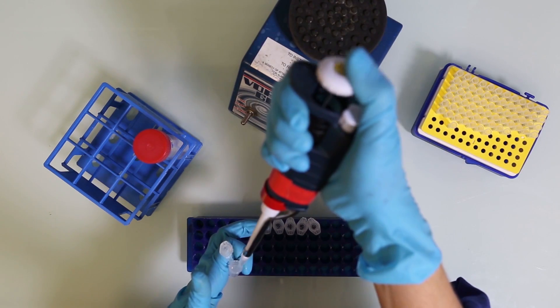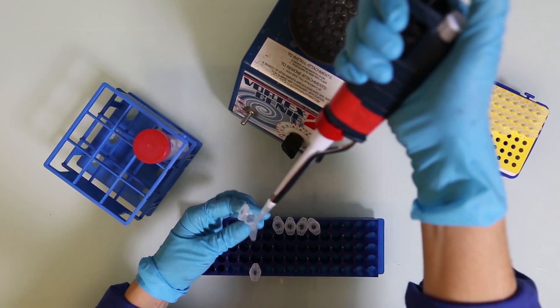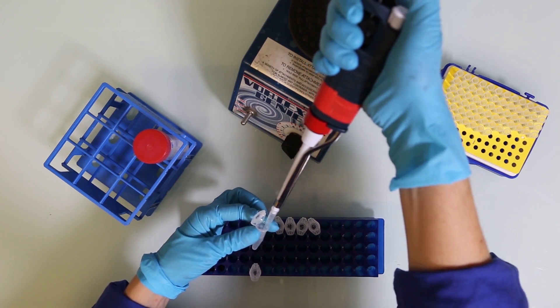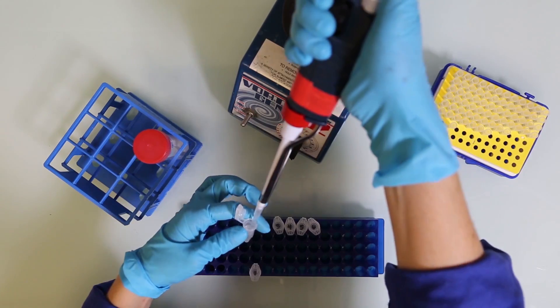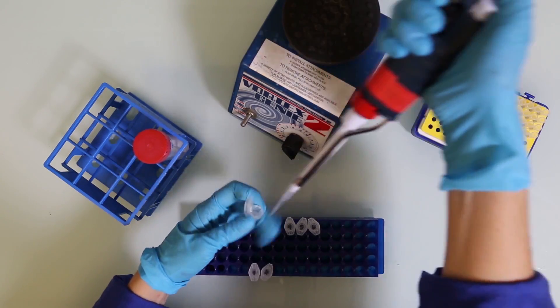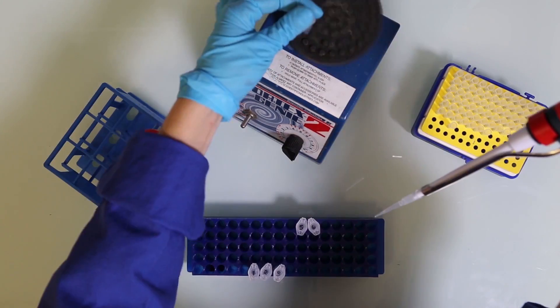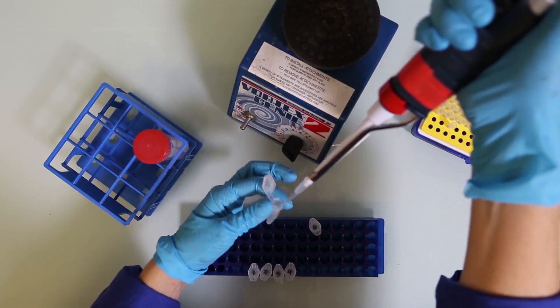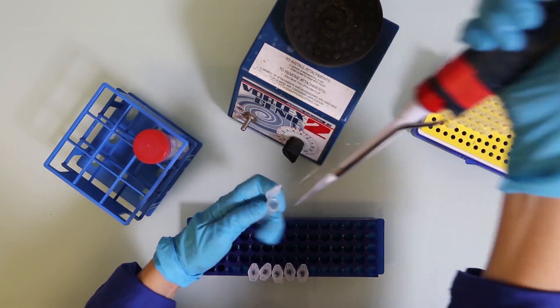Next, we take 100 microliters of this solution and mix it with 900 microliters of water to give us 1 in 1,000. We keep doing this until we get 1 to 10,000, 1 to 100,000, 1 to 1,000,000, and 1 to 10,000,000.